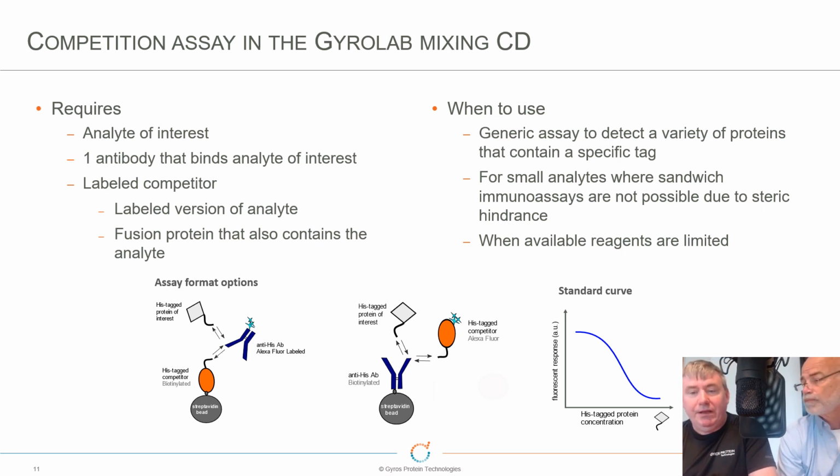The thing about competitive assays, we have finite reagents rather than excess reagents. So this does change how you actually set the assay up. So if you want to set up a competitive assay, I would suggest that you contact your field application scientists, and they can really help you.